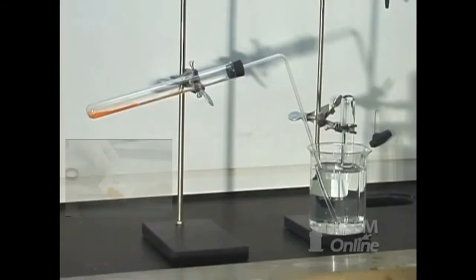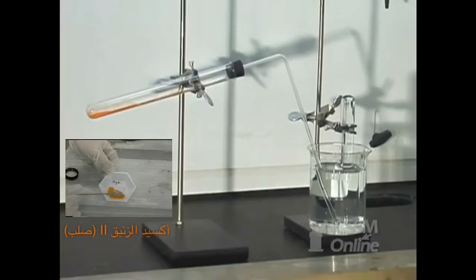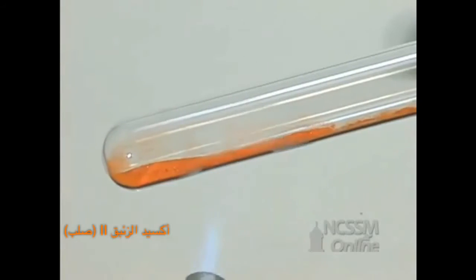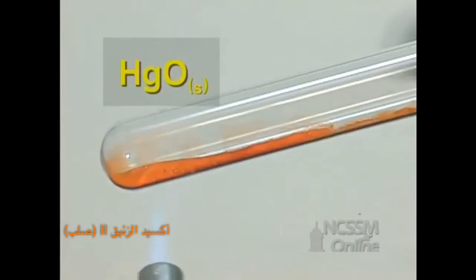In the classic experiment of Lavoisier, mercury 2 oxide is heated, producing mercury metal and oxygen gas. In the test tube, we have a sample of red mercury 2 oxide.